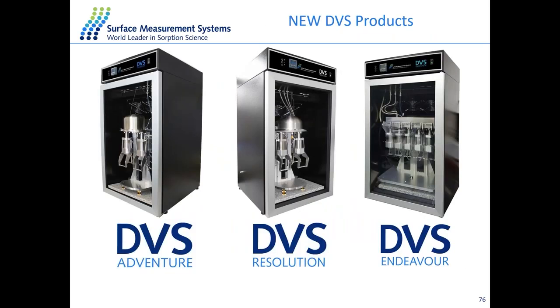So that concludes basically the data that I wanted to show you today. All the data that I showed you today were collected in one of these three instrumentation, which are fairly similar in the structure. We define it as Adventure, Resolution, and Endeavor. The difference in the instrumentation is related to the difference in capacity of what the system can do. So a DVS Adventure can run experiment only in water. A DVS Resolution can run experiment in water and or organic solvents. So the latest set of data was run on a Resolution.